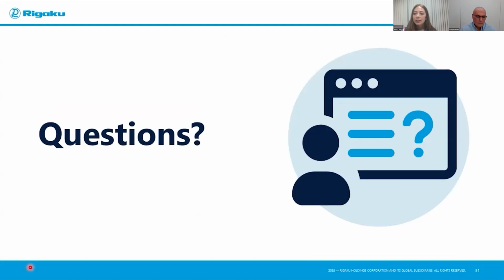And at this point, I think we are going to pause and answer any questions that you may have. So we have a couple of questions. Let's answer one now. Does the Rigaku Synergy instrument have EDS capability?